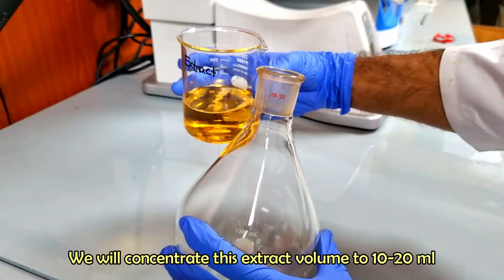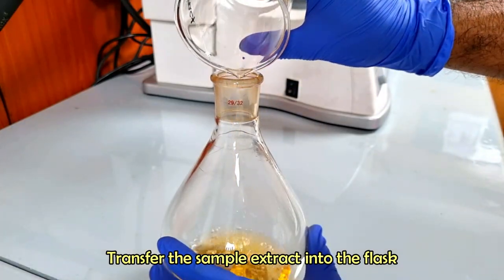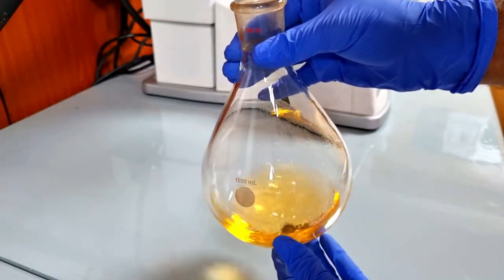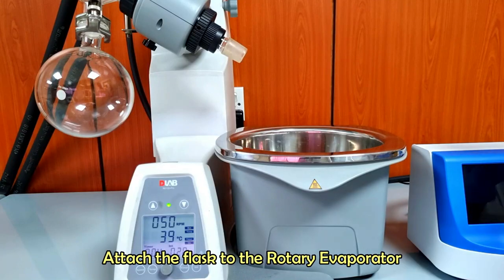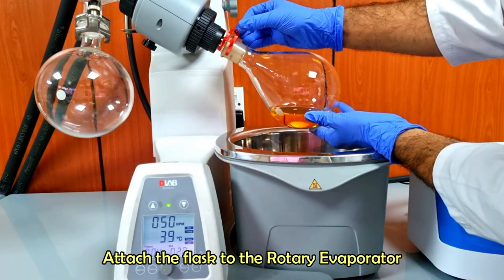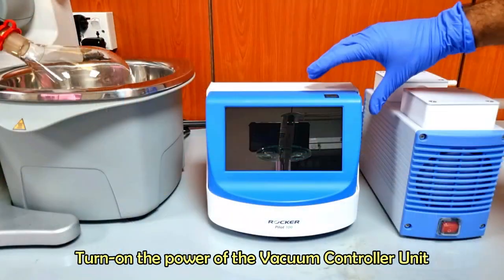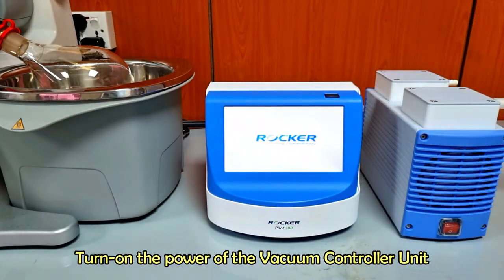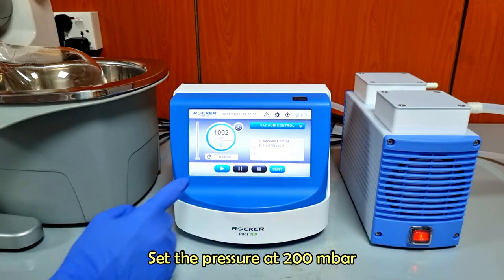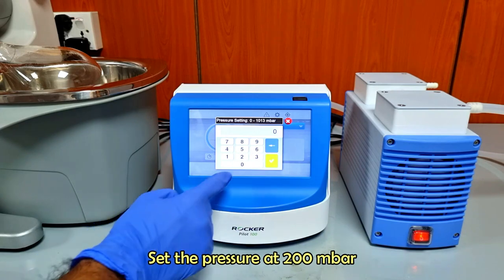Let's concentrate the extract volume to 10 to 20 ml. Transfer the sample extract into the round bottom flask. Attach the flask to the rotary evaporator. Turn the power on of the vacuum controller unit. Turn on the pump. Set the pressure at the proper point. In this case, 200 millibar is enough.